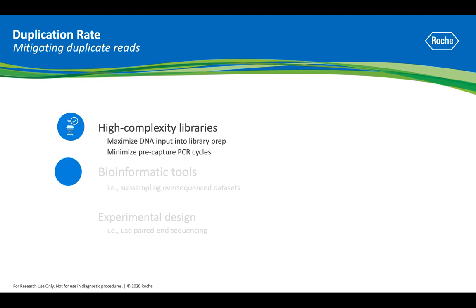Second, where possible, use the appropriate bioinformatic tools and methods to lower duplicate reads in the final data. For example, subsampling reads from over-sequenced data down to the desired read depth can rescue the decrease in data inaccuracy due to the duplicates, improving metrics such as coverage and allele frequency.